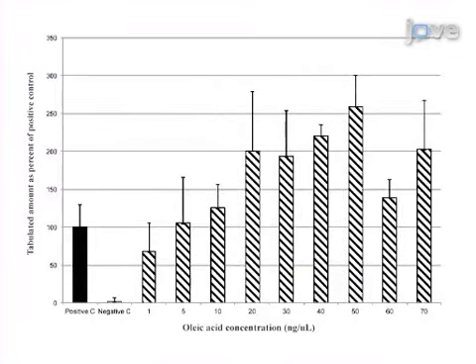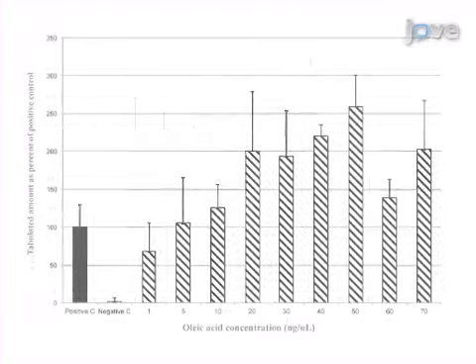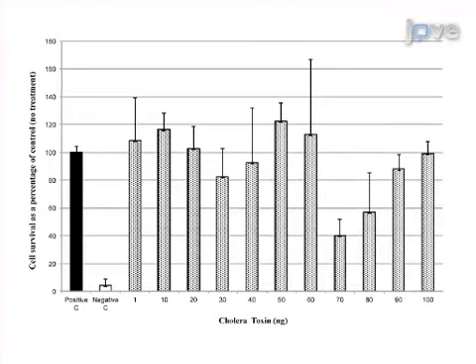Ultimately, spectrophotometry data from the MTT assay show optimal concentrations of fatty acids and cholera toxin with which cells can be treated without significant reduction in survival. The implications of this technique extend towards the prevention of cholera infection because vaccinations are not always successful.